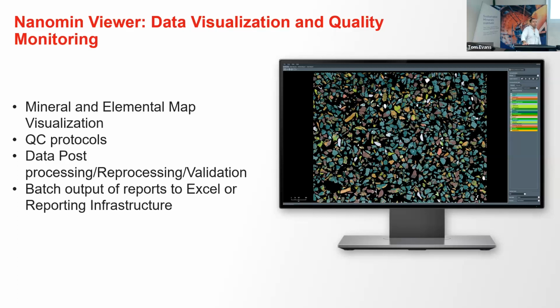For example, I remember working with MLA. Sometimes when we have our images, you can clearly see the edges of the fields. Sometimes you have repeated particles, sometimes you have gaps, and that puts a lot of strain on the stages. So the stages always need to be recalibrated with very precise movements. But these are all mechanical stages that we have on the SEM. Of course, there are piezo stages as well, but they are way more expensive.